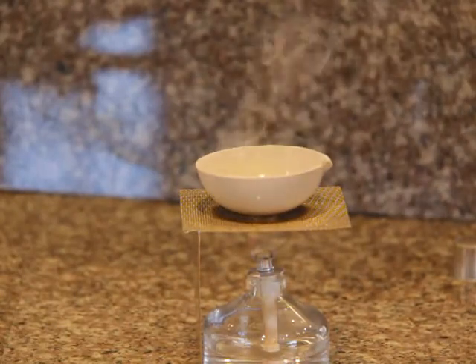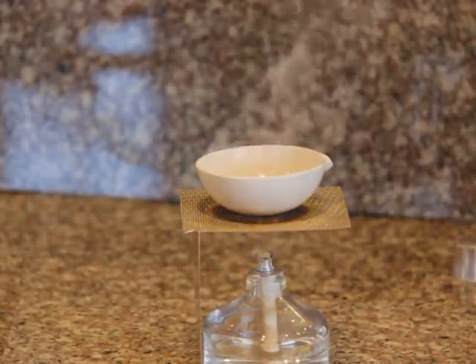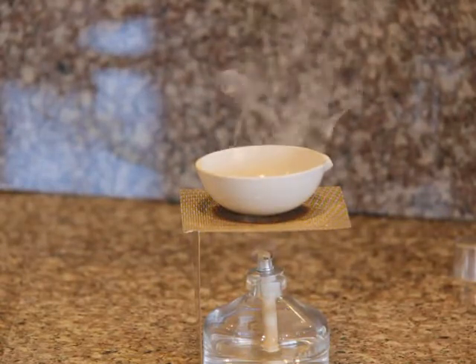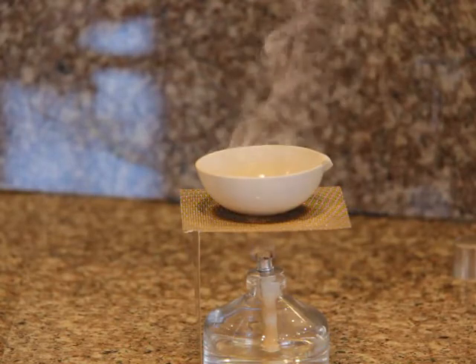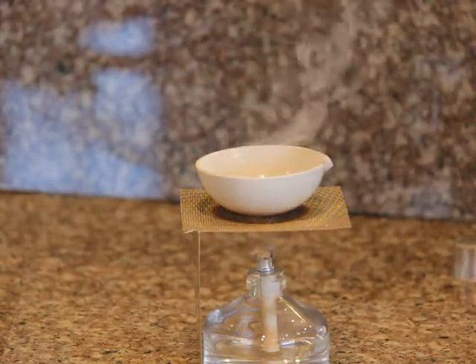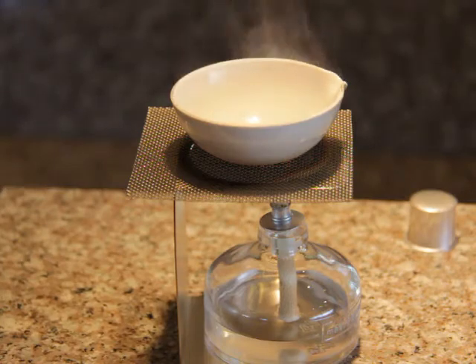To do a sniff test, carefully fan some of the vapors that are coming out of the evaporating dish towards yourself. And don't inhale.